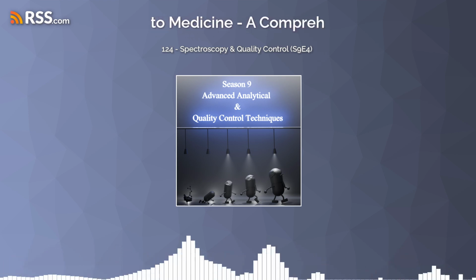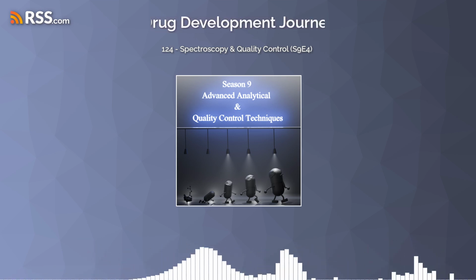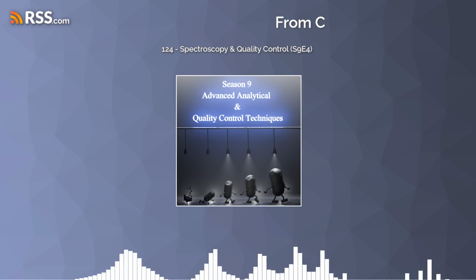Got it. So we've got UV-Vis for identifying compounds, quantifying them. Right. We've got IR for the functional groups. Yes. Now there's this thing called Raman spectroscopy, which sounds a little bit different. It is a little different.